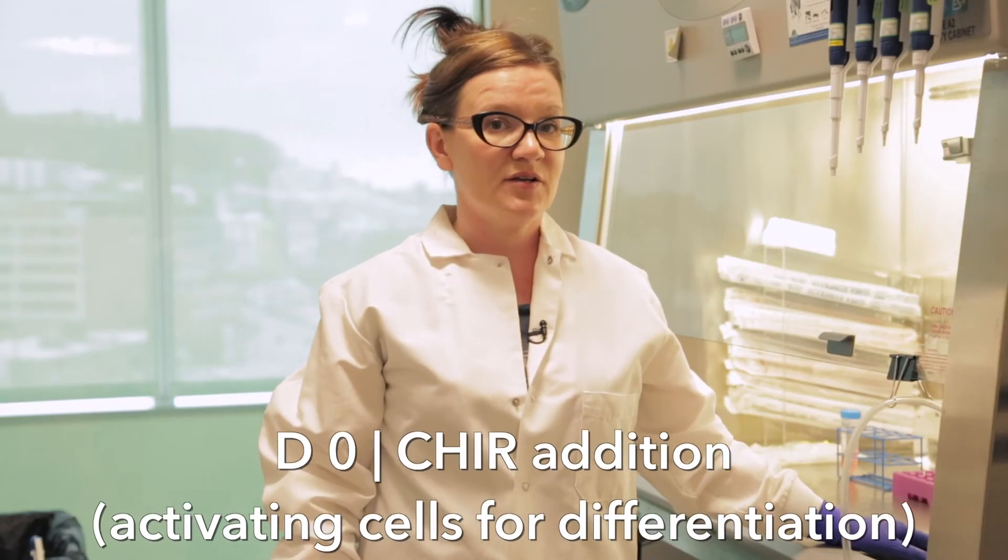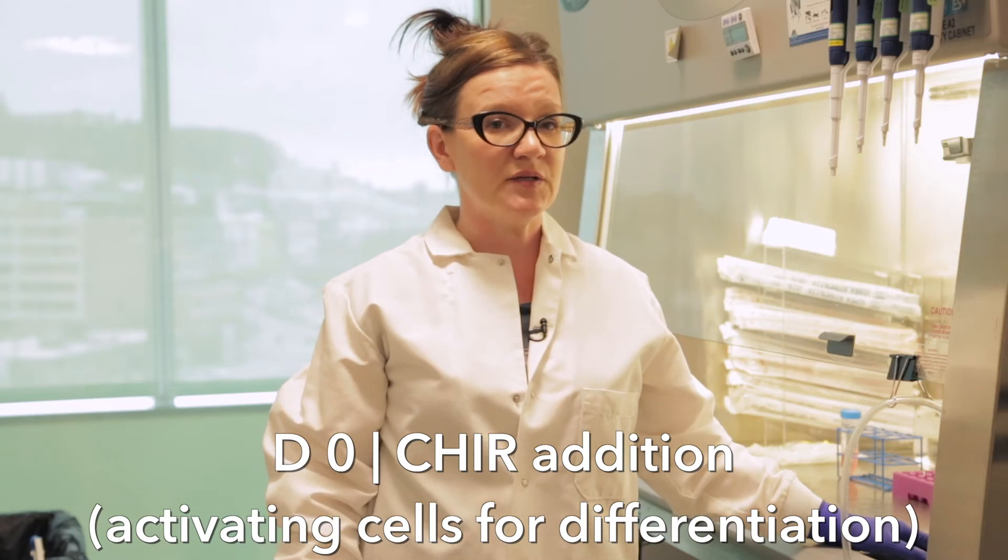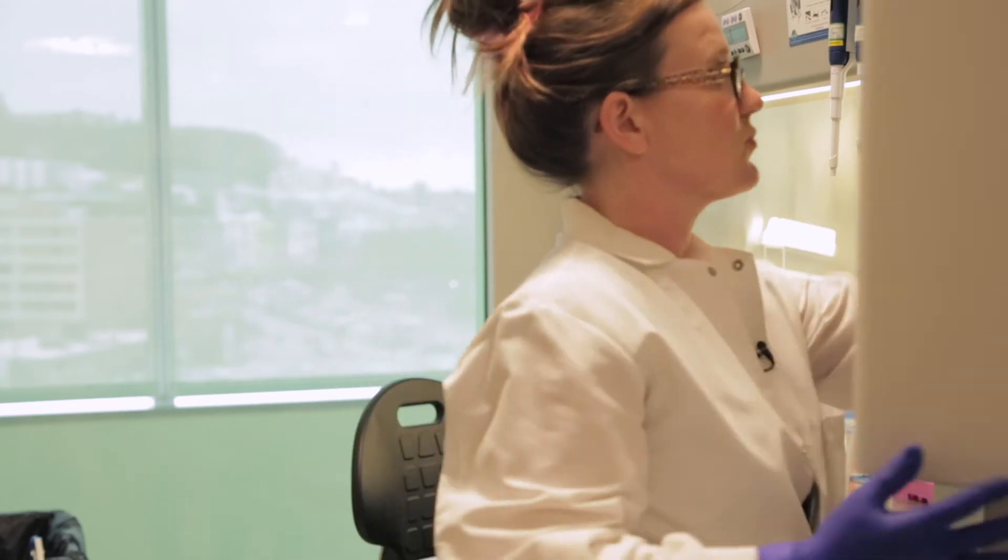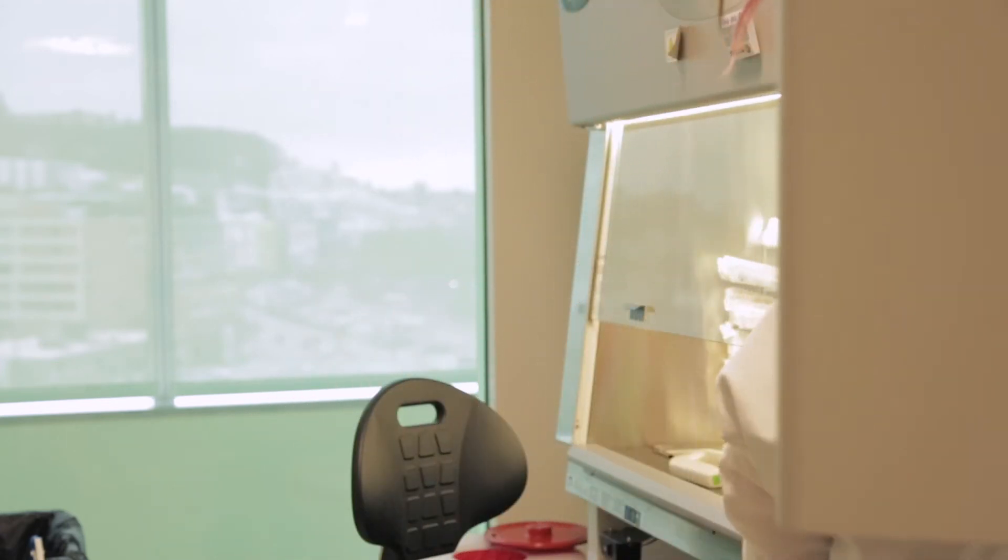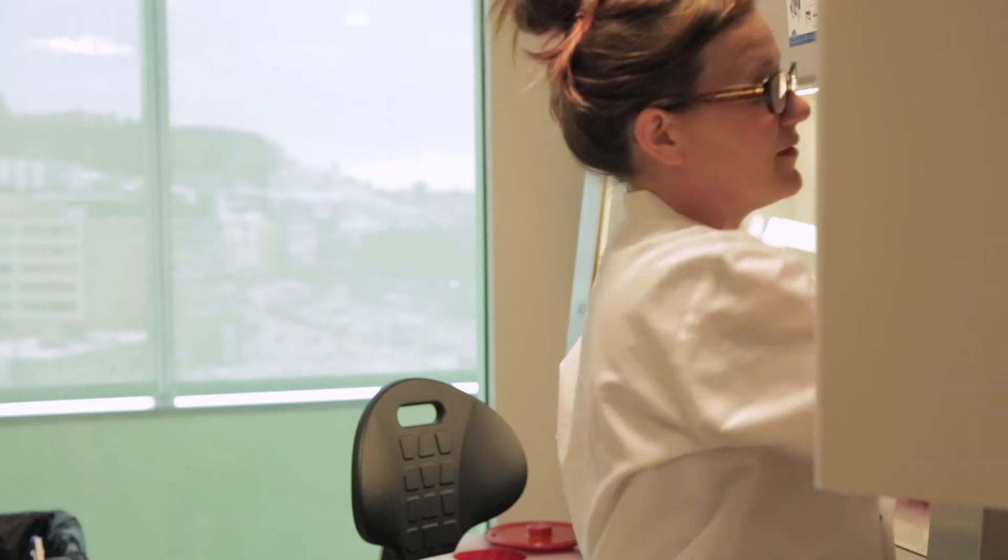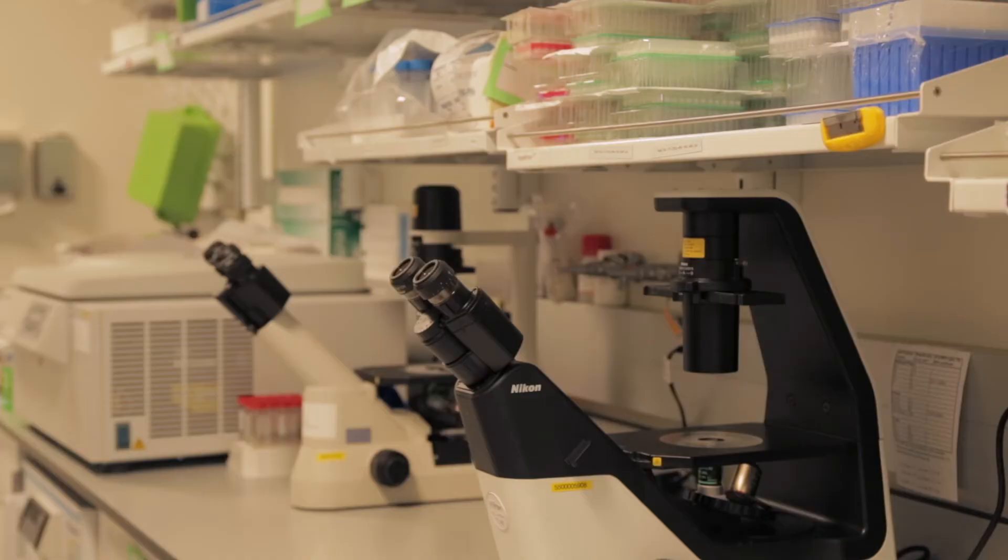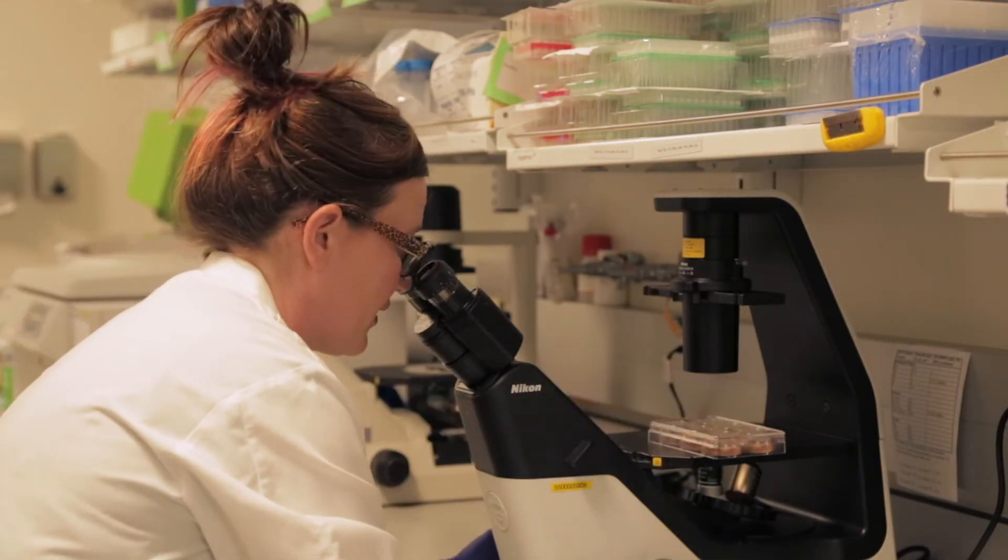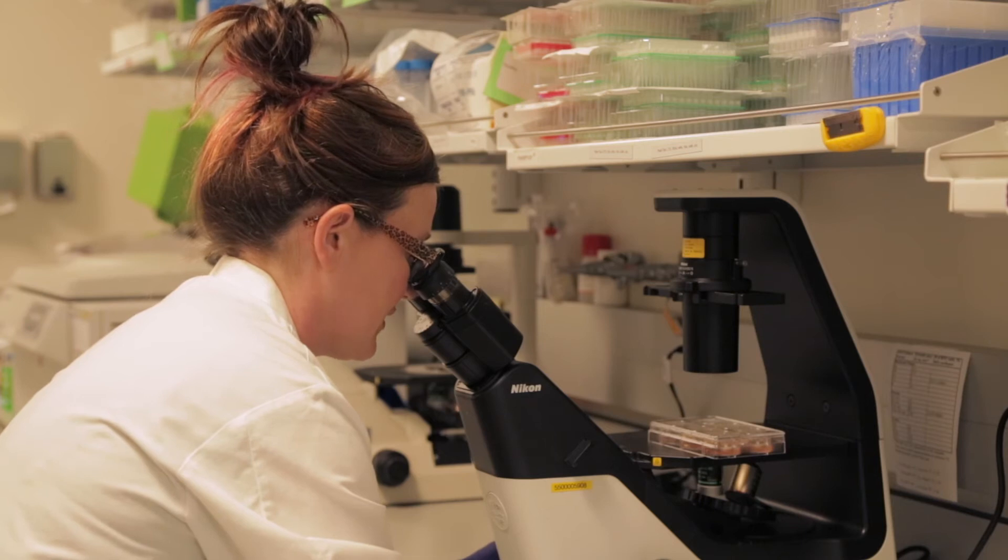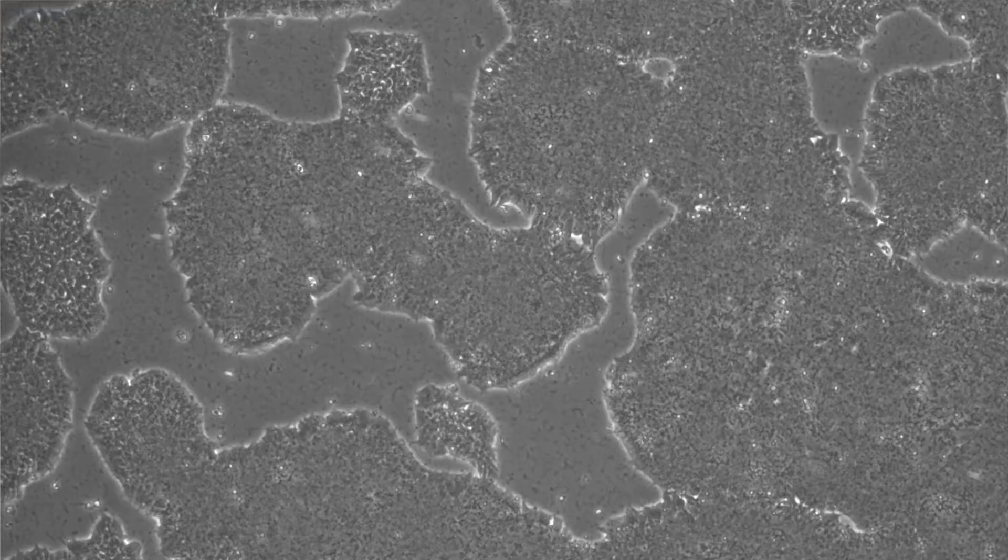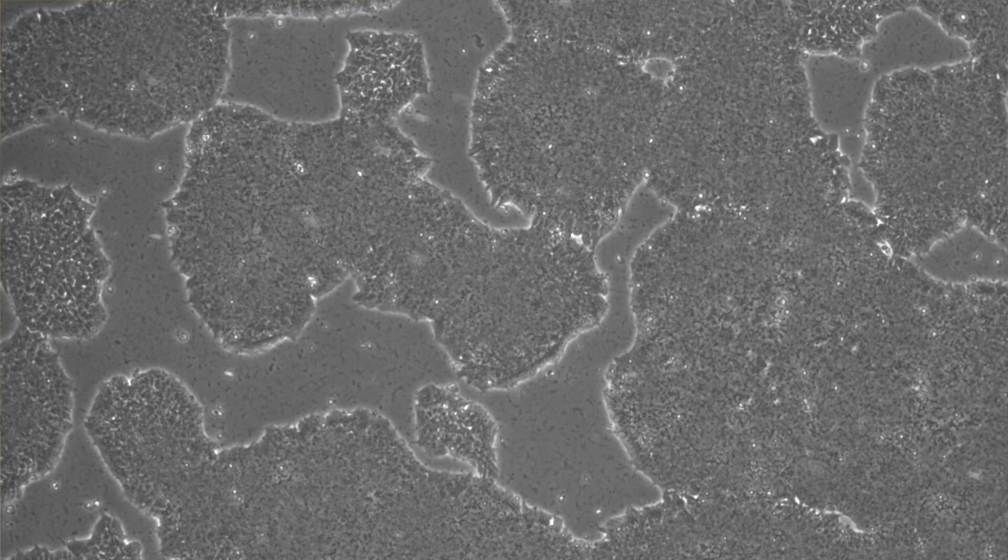Today's day zero and that's when we actually activate the cells for differentiation. Let's quickly look at them under the microscope first to look at confluency and their morphology. So today what I'm looking for is a really nice, undifferentiated stem cell-like morphology. If the cells are not healthy and undifferentiated going into the differentiation, it's likely that it won't work. Also, I'm looking for the different confluencies as I did plate out different densities of cells on day minus three.